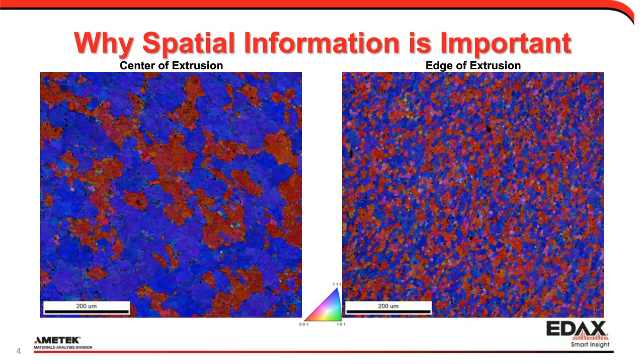So if we were just looking at the sum data or a chart of this data, we couldn't see these distributions as well as we can see it visually. It jumps out. So when we talk about correlating data, a lot of times what we're going to do is take one map from one technique and another map from another and line them up so we can start to see how the data from one compares to the data of the other.